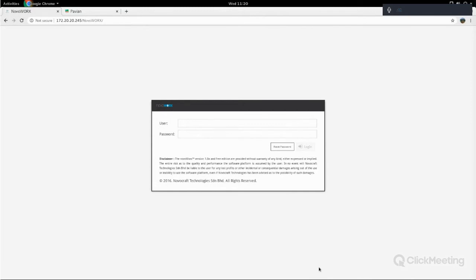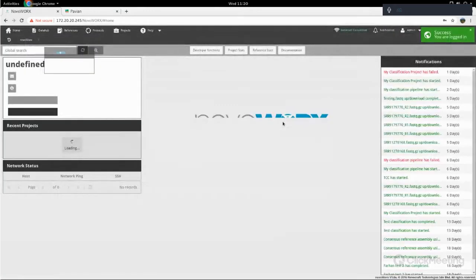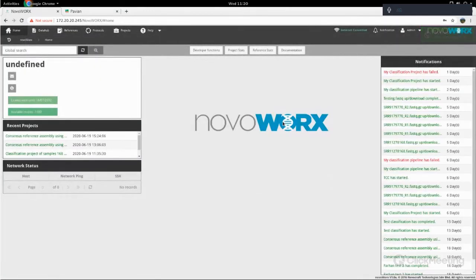And key in your username and password. First, we go to the Data Hub section.